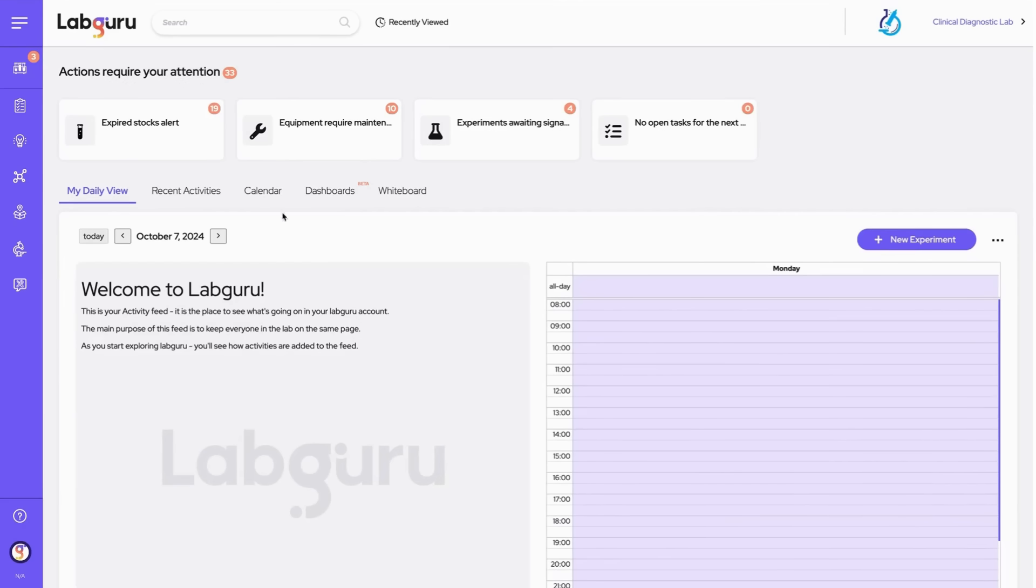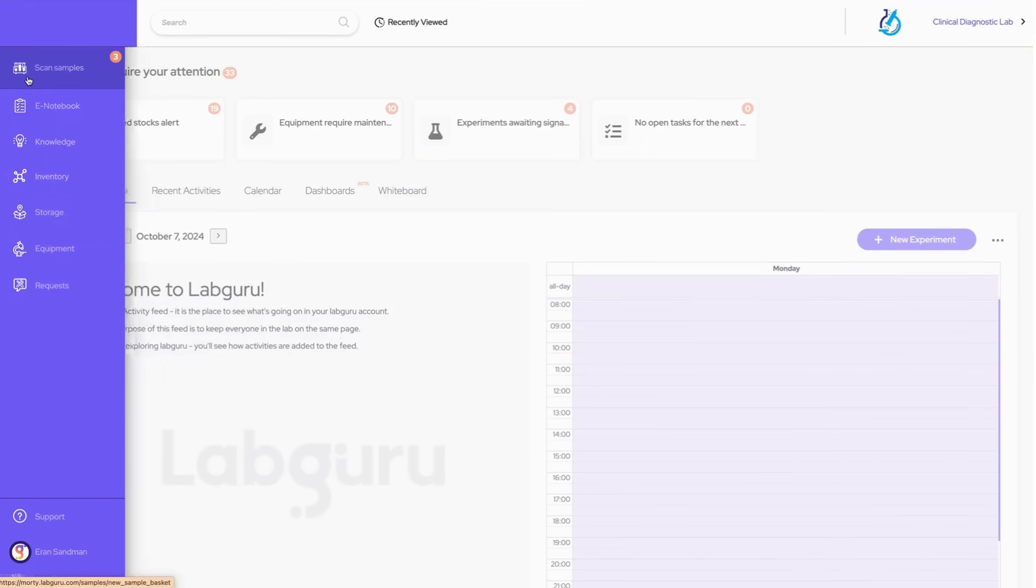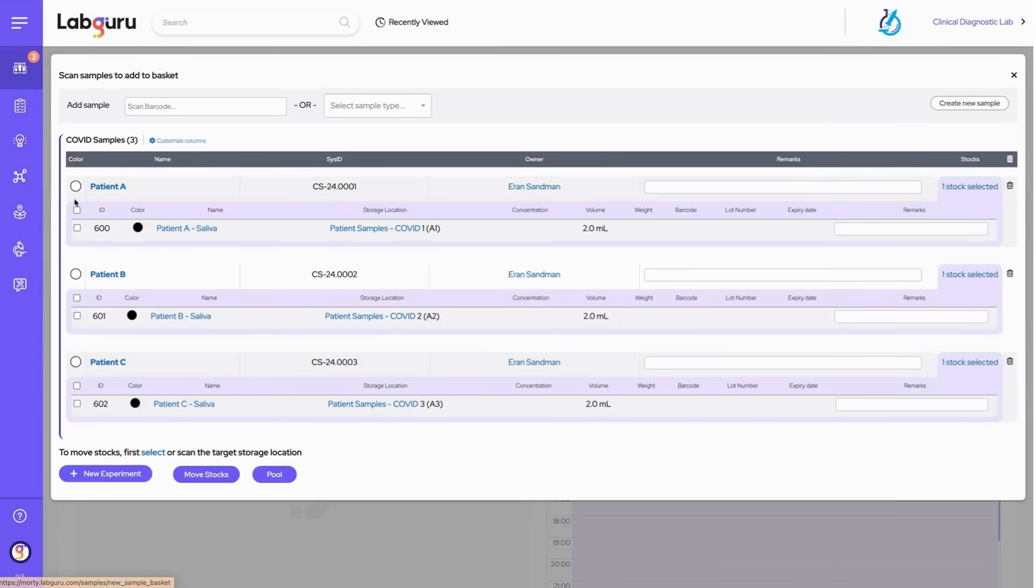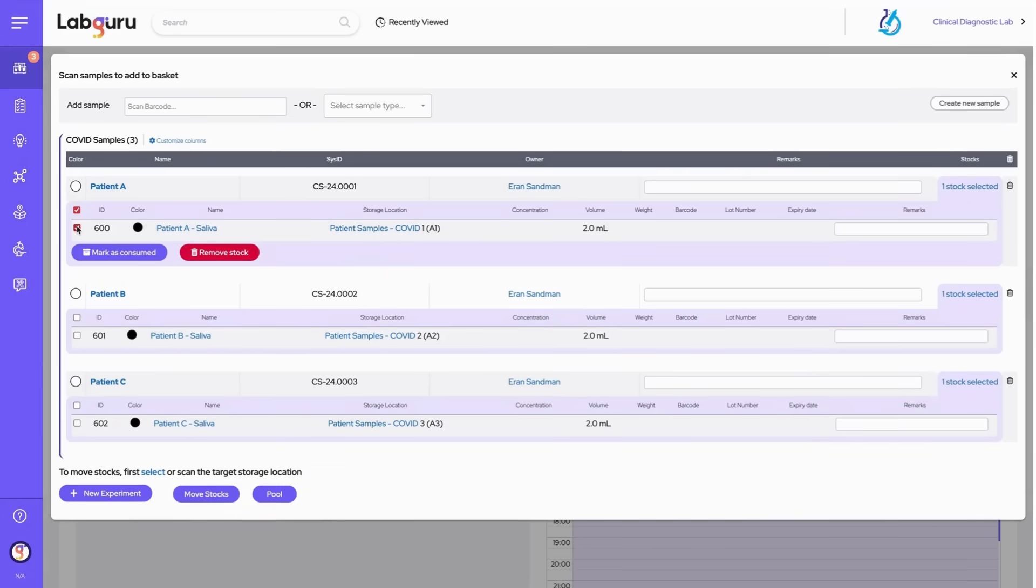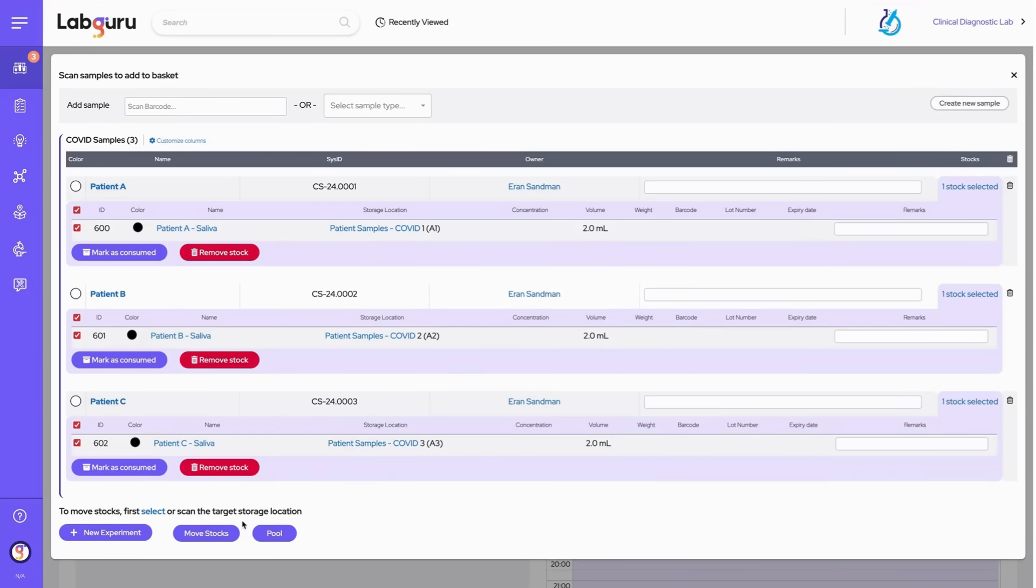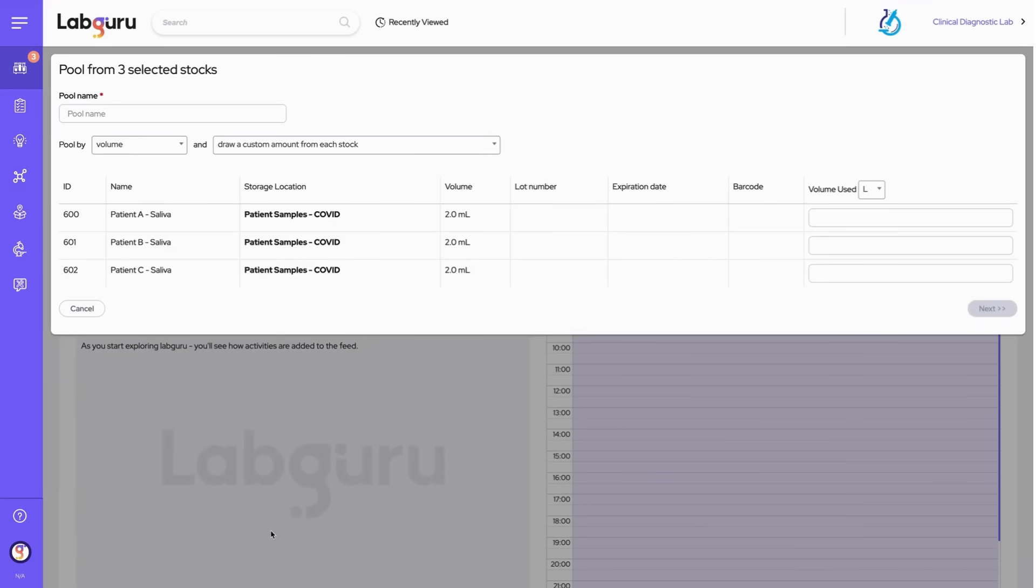Let's begin our demonstration in the sample basket. We select the samples that we would like to pool. After Labguru gathers the selected stocks, we begin the process of combining them into one.